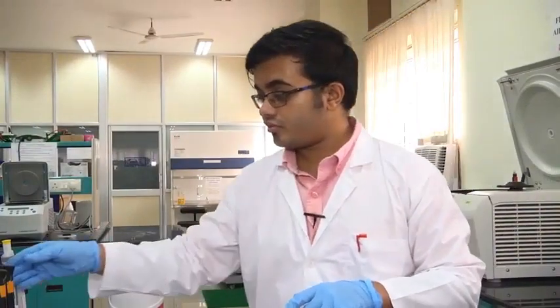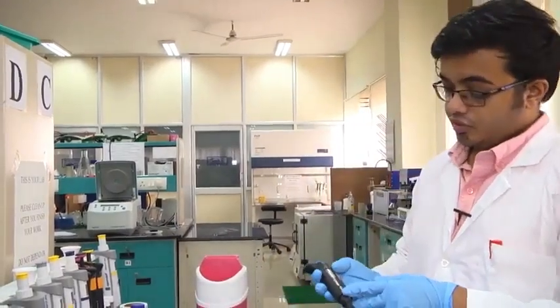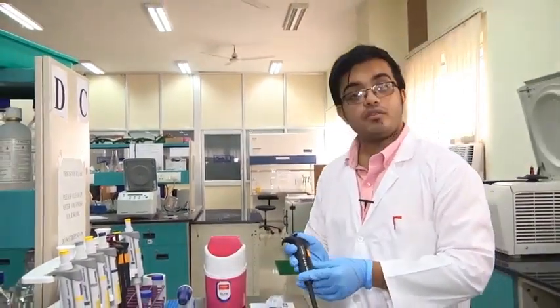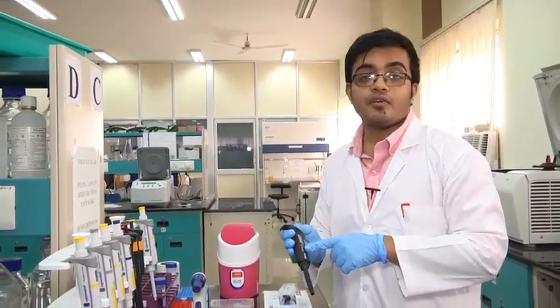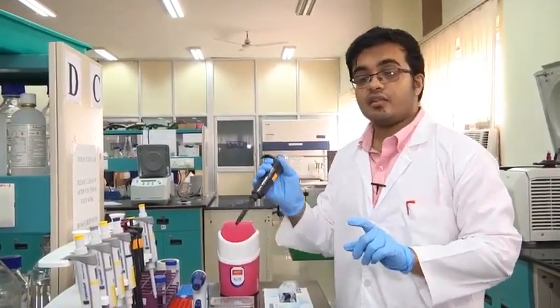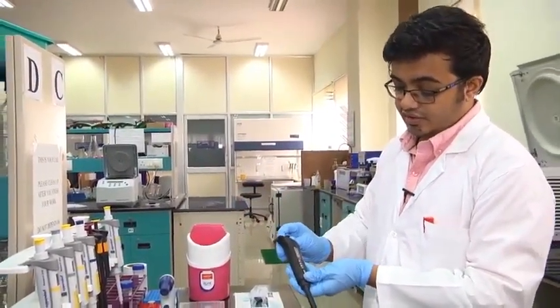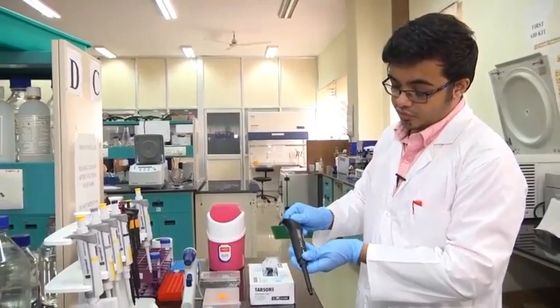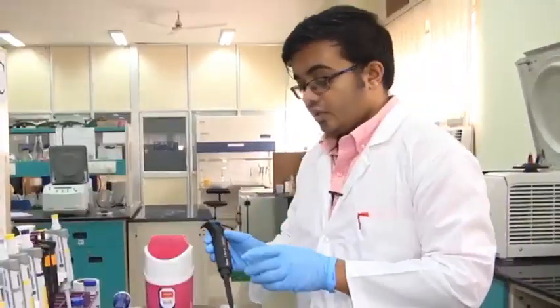So now I am going to demonstrate how to actually use a pipette in the lab. I am going to take a 100 to 1000 microliter pipette, and let's say I want to collect 1 ml of a particular solution and then dispense it into my desired container. First of all, let's set it at 1000. Suppose it was set lesser, we just go up and set it at 1000 microliters.